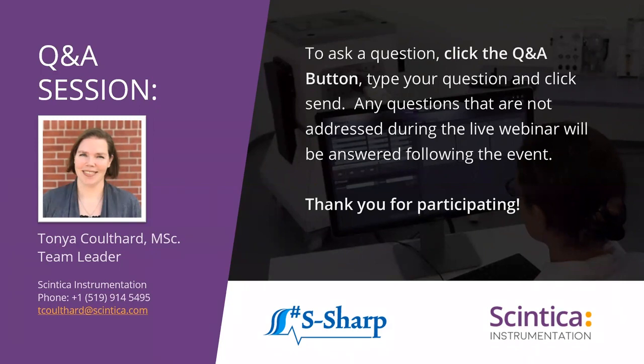Great. Okay. What's the maximum frame rate in B mode? Yep, so this often will come up with cardiac researchers, and I was surprised it wasn't one of the first questions that I scrolled through. The frame rate with a single element transducer is 30 frames per second for normal B mode imaging. The system does have a specific cardiac reconstruction mode, which is basically where the system is going to take as many 2-dimensional B mode images as it can, acquired with that ECG signal, and it can then reconstruct those images back into a cine loop of the entire cardiac cycle, and that would be at 190 frames per second. So that's going to give you a very nice frame rate for looking at cardiac function.